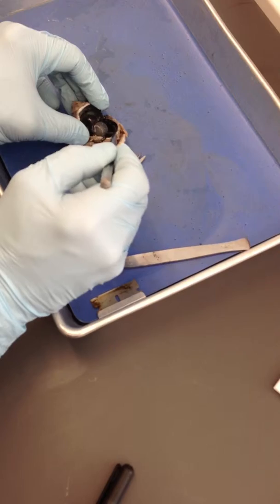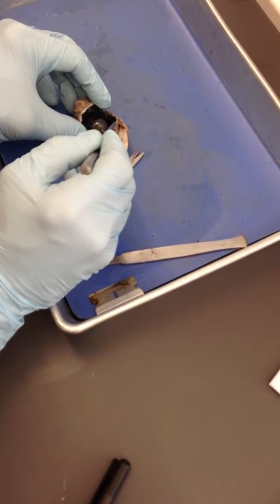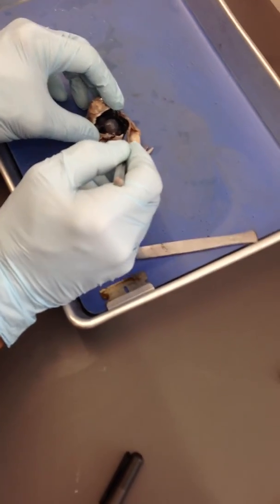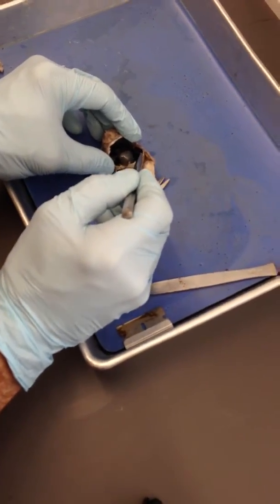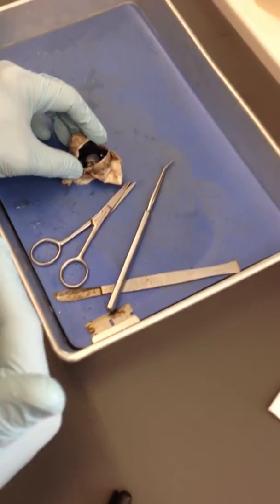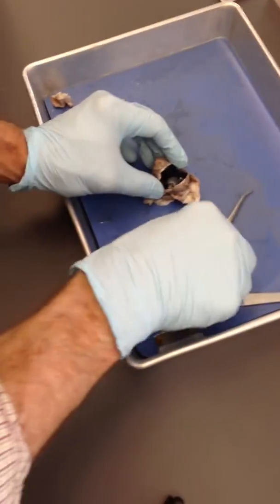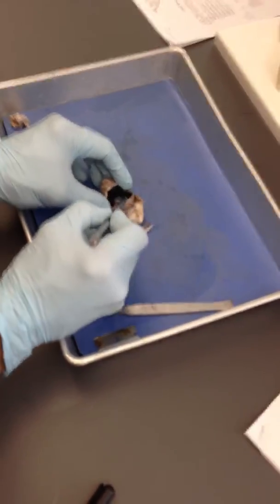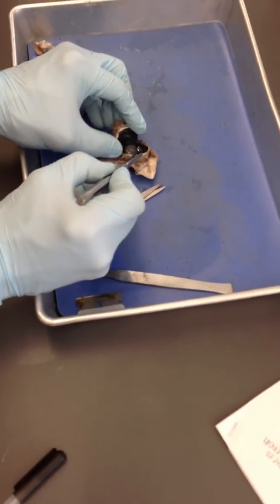And the lens is suspended by ligaments from the ciliary body. So this dark structure is the ciliary body, right here. And there are ligaments that run to the lens and can flatten the lens for distance viewing, and also relax, allowing the lens to become more circular in nature, and therefore able to view close up.